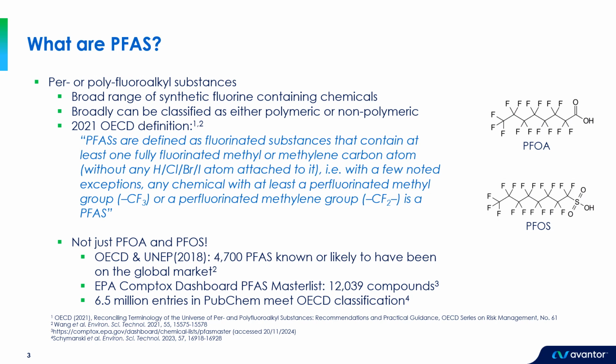So PFAS are a very broad range of synthetic fluorine-containing chemicals that have been widely used since around the 1950s. Very broadly, we can classify them as either polymeric or non-polymeric. And today, it's those non-polymeric PFAS, such as PFOA and PFOS, that we're going to be focusing on.